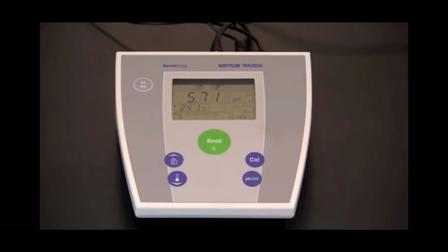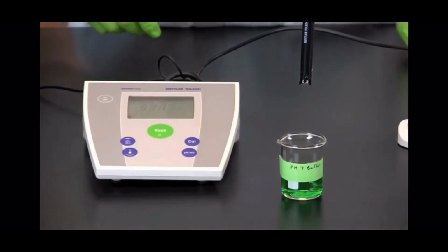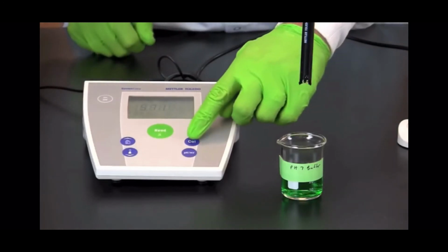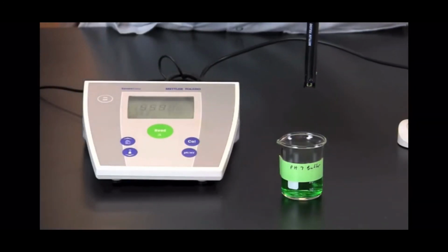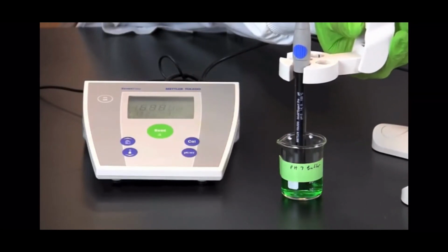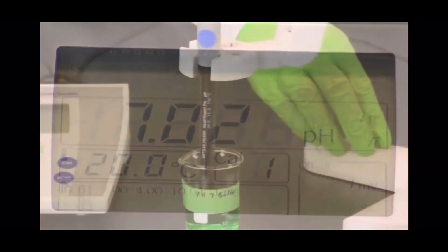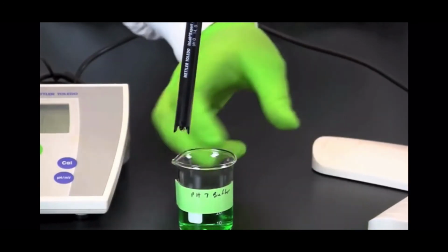Various pH meters will have different procedures for calibration. To calibrate your pH meter, you will need to review the owner's manual for the proper procedure. Begin the process of calibration using the standard with a pH of 7. Once the standard has been calibrated, you will need to remove the sample and rinse the electrode with distilled water.